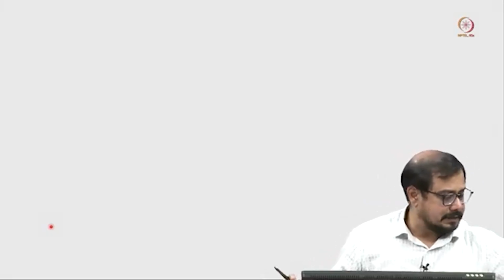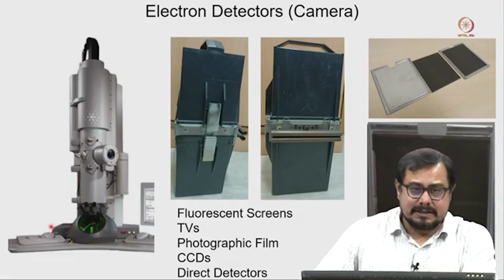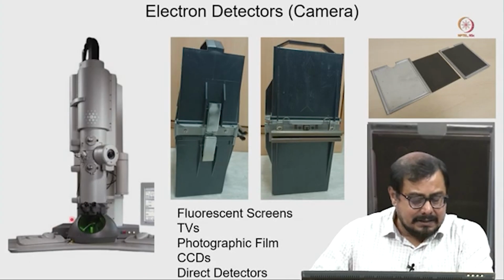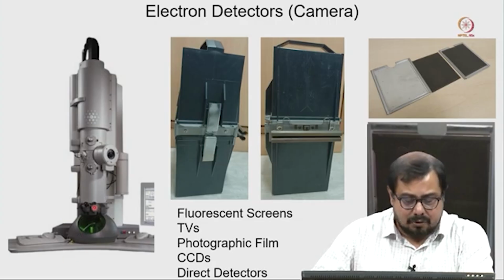So, mostly for cryo-electron microscopes we are using different types of detectors. First I want to show you a very basic detector system, and what kind of detector we can use. Here, you are familiar with this, this is the electron microscope, and this is the viewing chamber through which you can see all the samples, and this is the binocular.